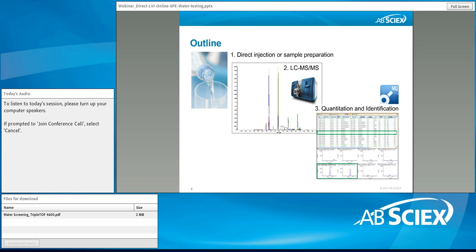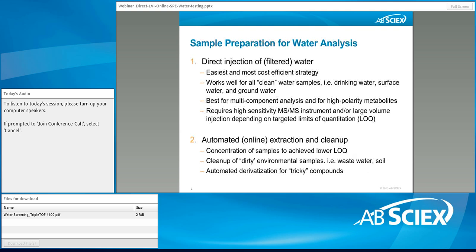A couple of thoughts around direct injection and sample preparation, and why we should use these things in combination with LC-MS for different types of applications, and then how we can quantify and identify our target analytes with very high confidence in water samples.